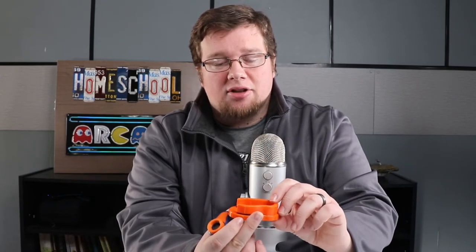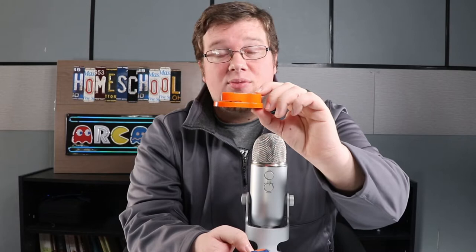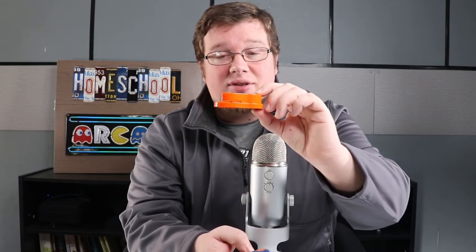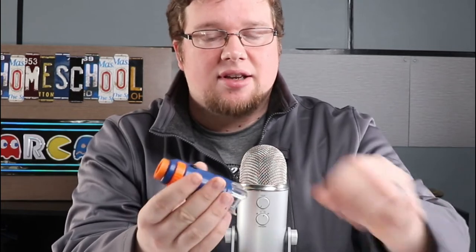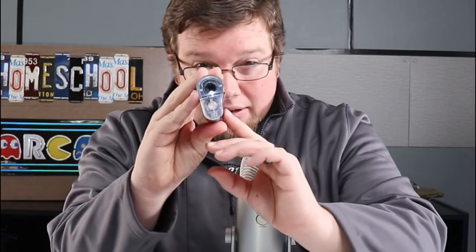They also have slide kits of different kinds for you to check out, and we actually have one of those with us which we'll show you in a little bit. Here we have the stand that the microscope can rest upon if you want a stable foundation while looking at a slide on a table or desk. To start, I'll pull this tab so the battery is active — and as you can see there's a nice little light for you to use with your slides.